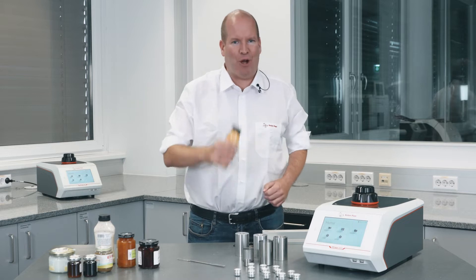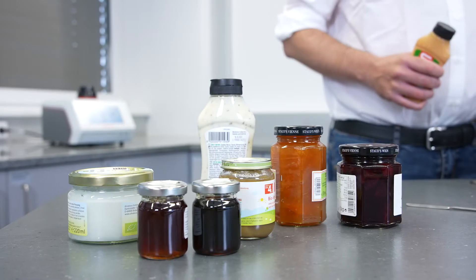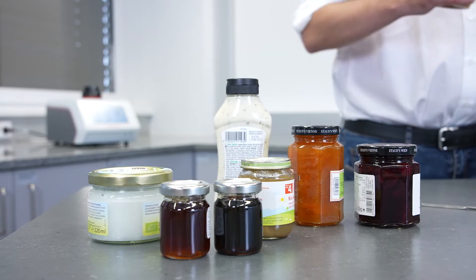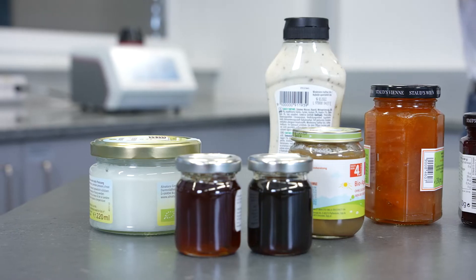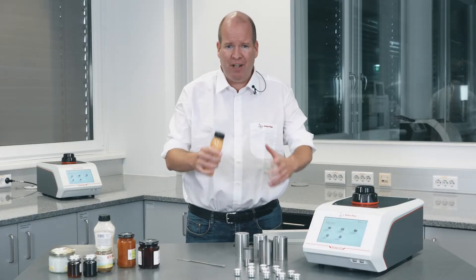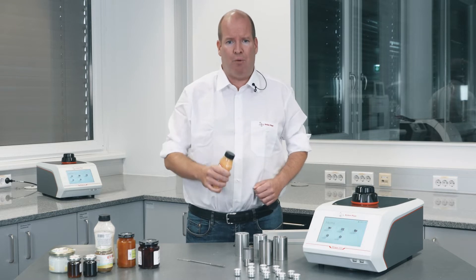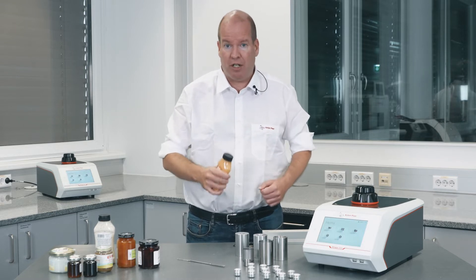Hi, I'm Tony and this is Lab Time with Anton Paar. Packaged food — whether it's dipping cups, condiments, or salad dressing — food manufacturers use filling machines to insert content into a package by volume, sealing it for distribution and sale. Often the packaging label indicates only the weight of the contents.